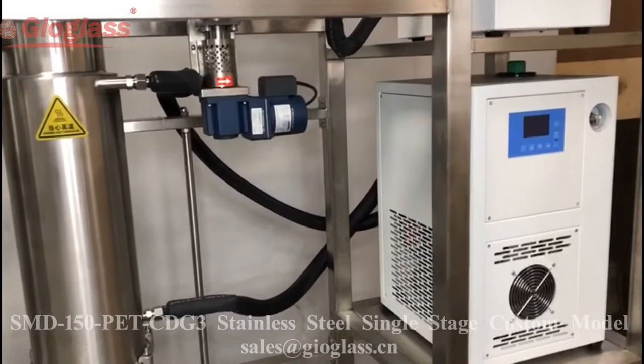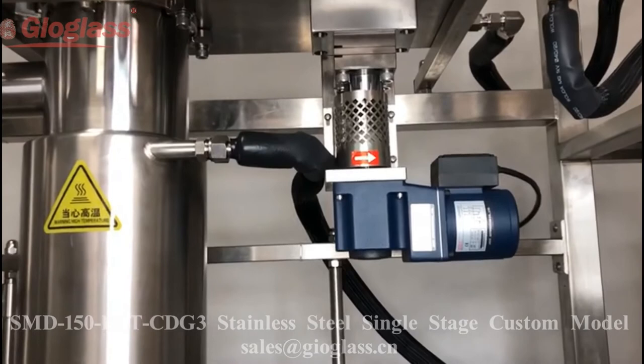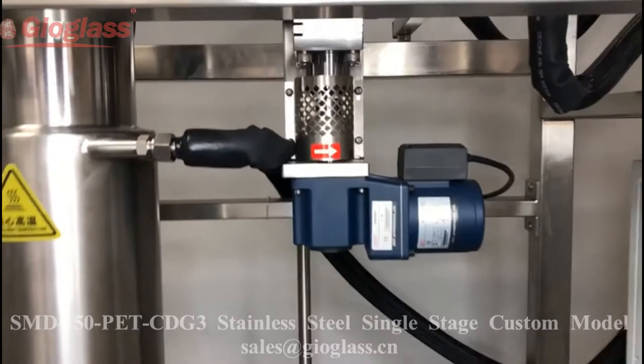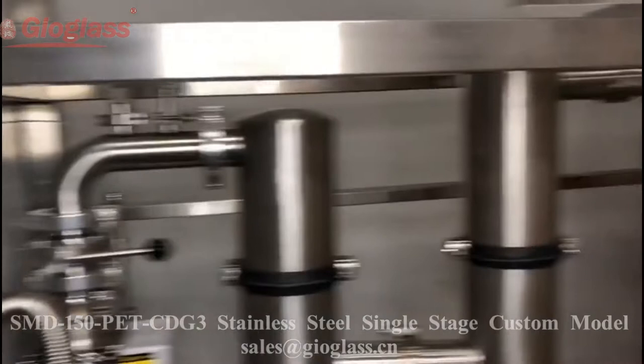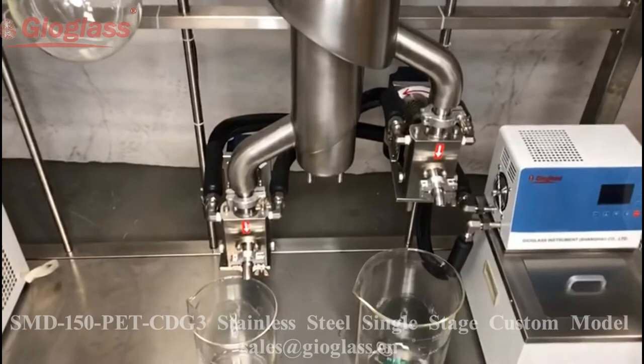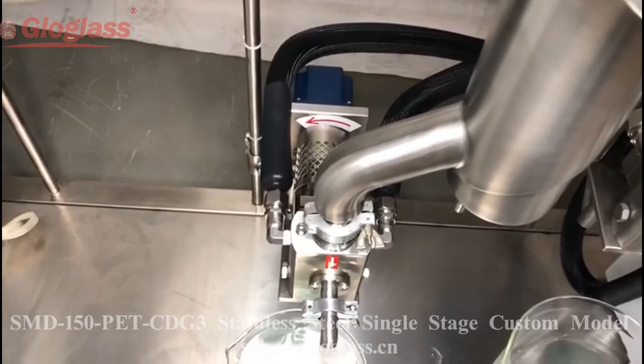G is for the gear pump. This gear pump is for feeding. The feeder can be controlled on the cabinet. There are also two discharge gear pumps, and these two gear pumps will be kept warm by a secondary heater.